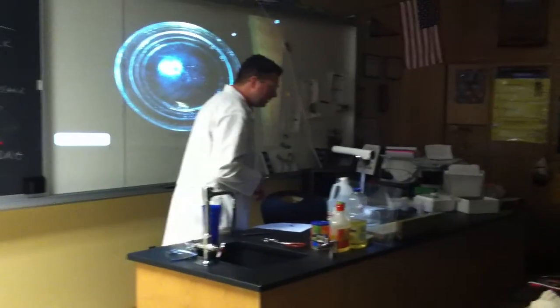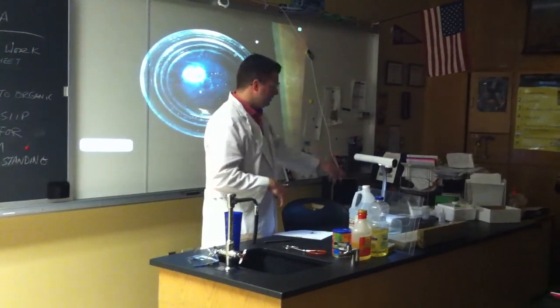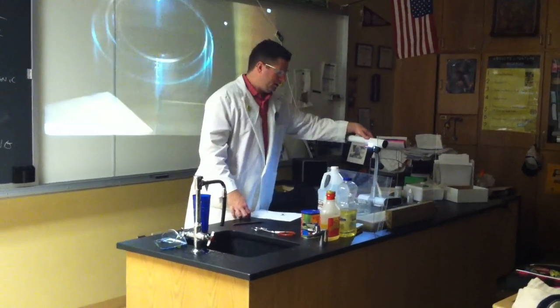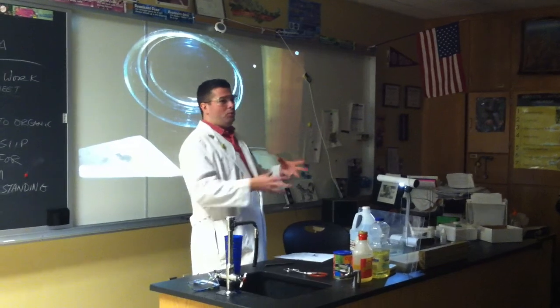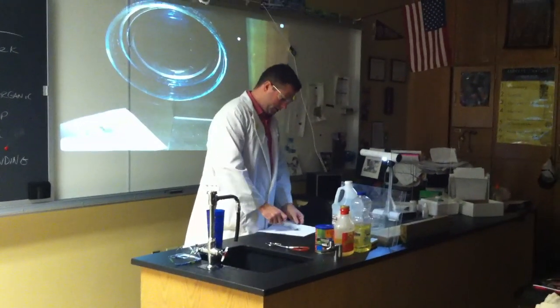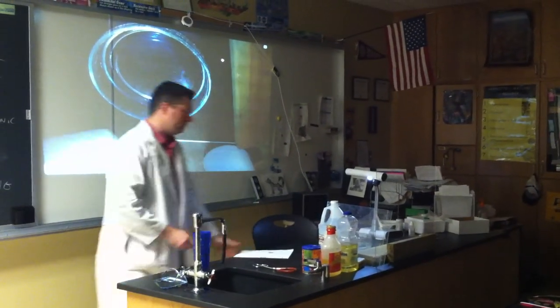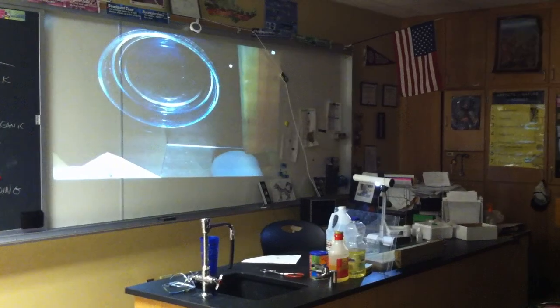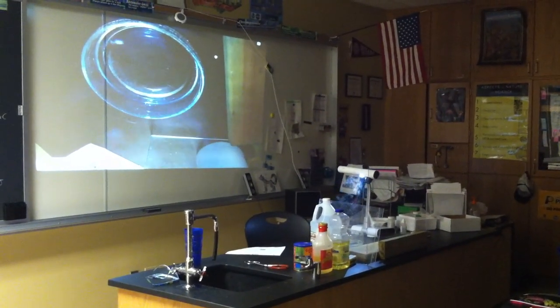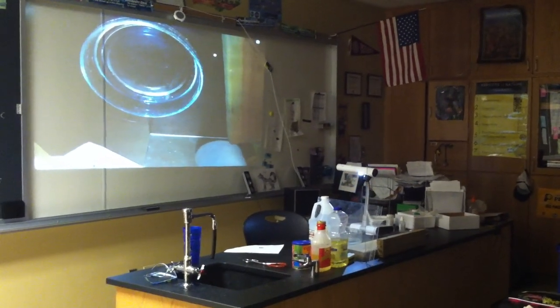But how many of you guys want to see a bigger pop? I want to see a big one pop. All right, so let's dump the whole thing. Actually, if you get enough of it, it will explode. This can actually break the glass on here, which I don't want to do, but we'll do a big chunk. I'm going to move back a little bit. All right, so a lot more heat. Look at the flame. Sometimes it catches on fire.